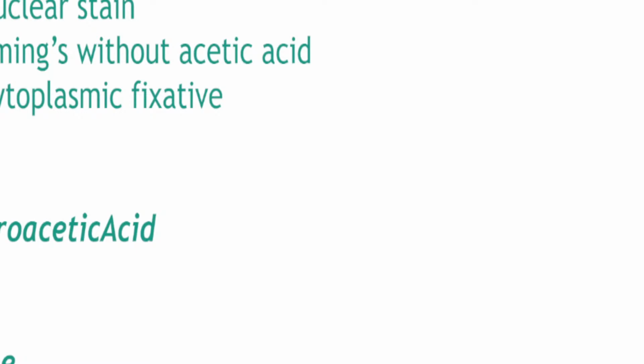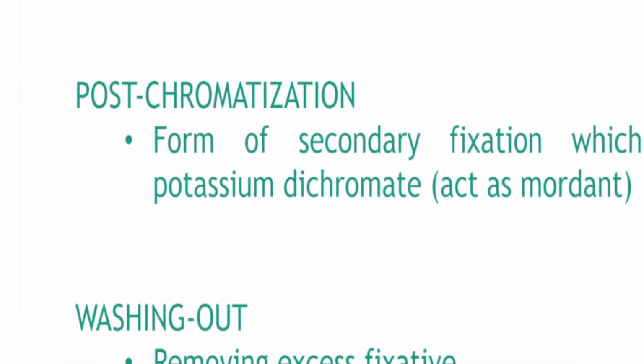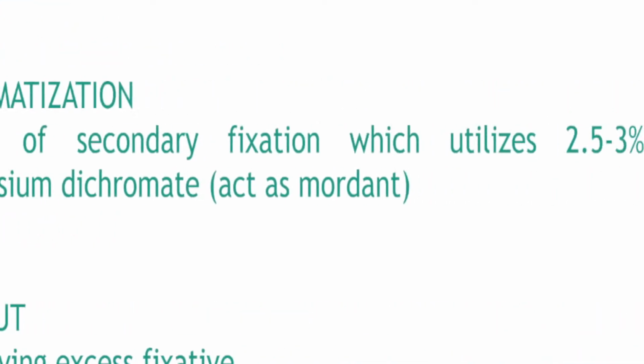Nothing much on that. If you want to learn more about that, I have a lecture prepared. You could watch it. But historically, ever since I've been doing this, nobody has mentioned trichloroacetic acid in the board exams. Acetone is commonly used for enzymatic studies. Histochemistry again.